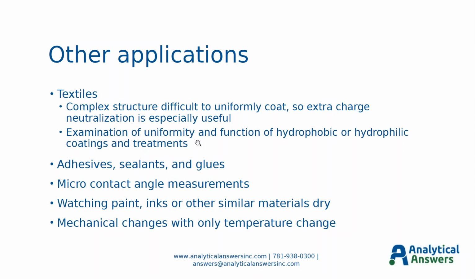But if you've applied coatings and treatments to different fabrics, then you can see how well they were applied by looking at how the individual fibers of a material wet as the water is introduced, and get an idea of how uniform those coatings are, how effective those hydrophobic or hydrophilic coatings are.